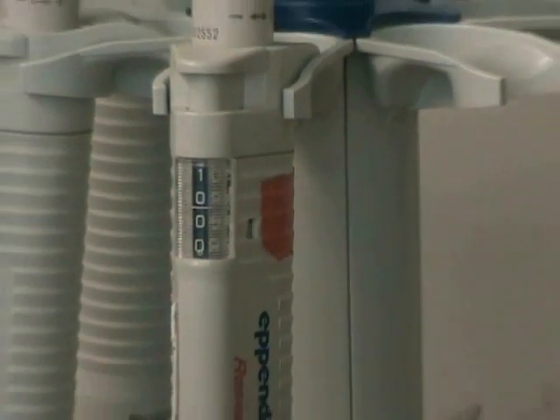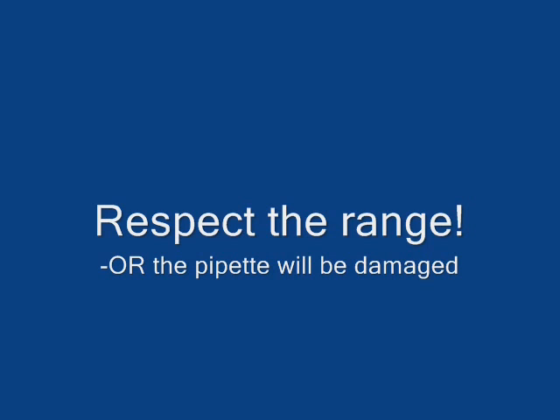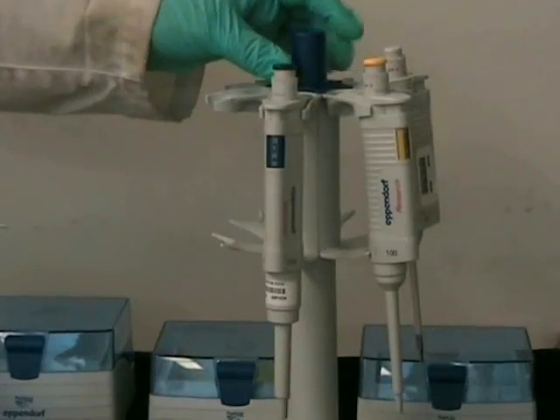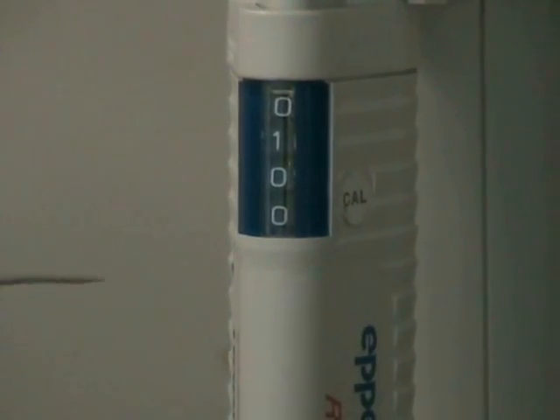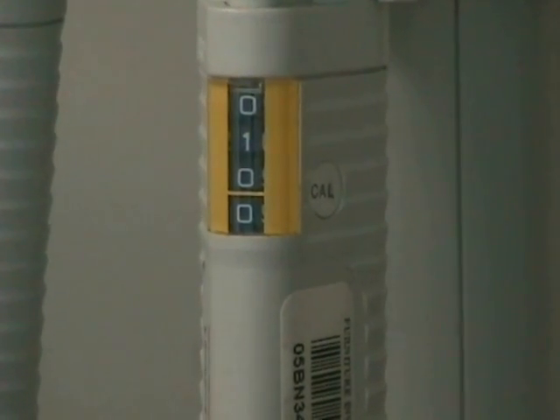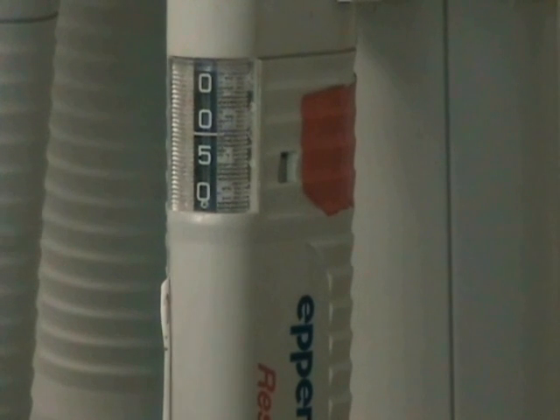Now we're just going to change these to their minimum volume. The P1000 has been set for 100 microliters, the P100 has been set to 10 microliters, and the P10 has been set to 0.5. Remember that the white bar or the yellow bar on the P100 is a decimal point.